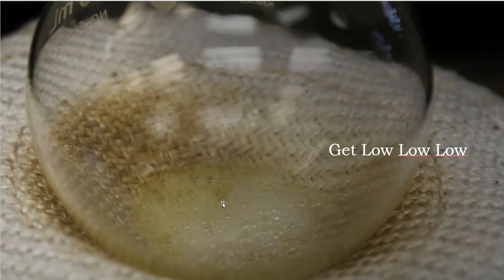All right, so as I begin to look at this boiling flask, it's getting low, right? It keeps disappearing on me, and I don't really like this. All that hard work I put in just to get a couple of milliliters? And the answer is yeah. Because think about how much hexene you started with, right? We didn't start off with very much. And that's probably going to be about the product that we end up with.